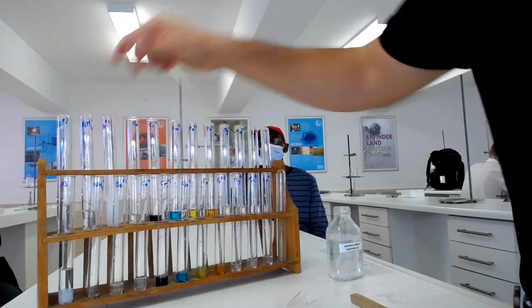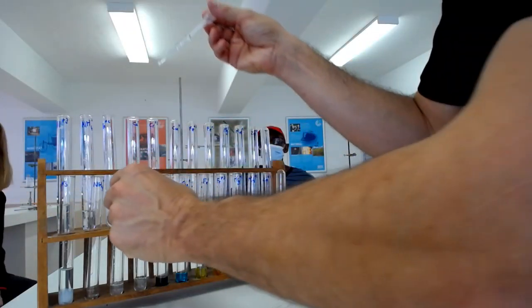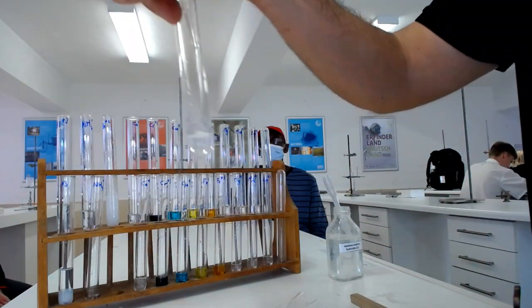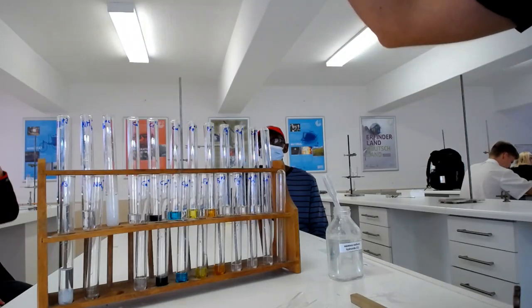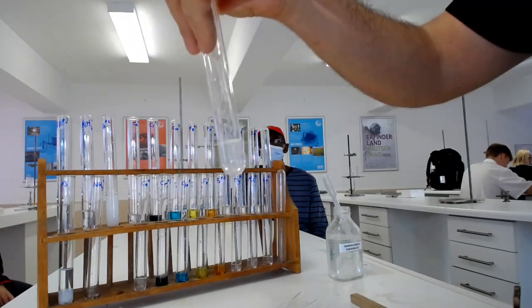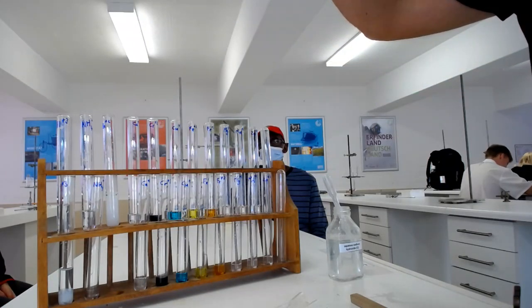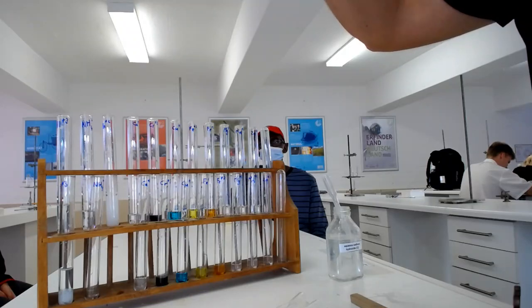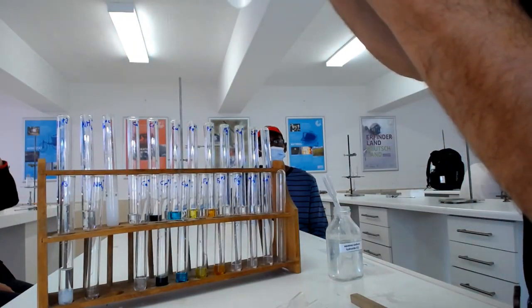So that's my sodium hydroxide. What about ammonia? What happens with ammonia? Also, the precipitate doesn't dissolve. Immediately when I add it, there's a white precipitate. What happens if I add excess? It just has no precipitate. No precipitate.